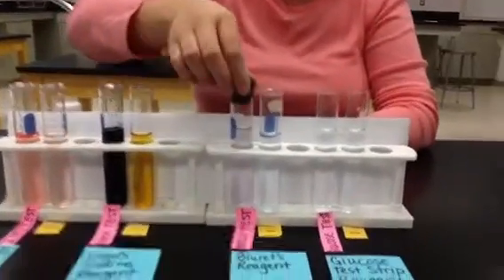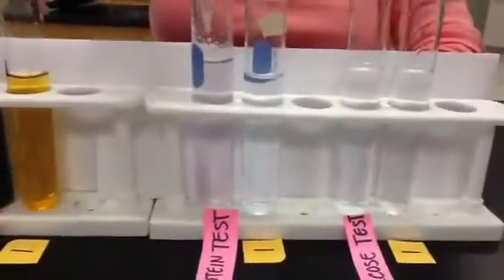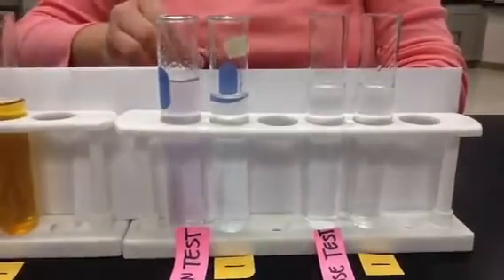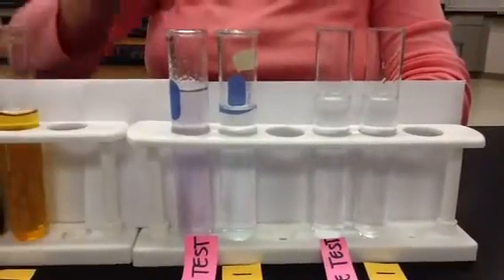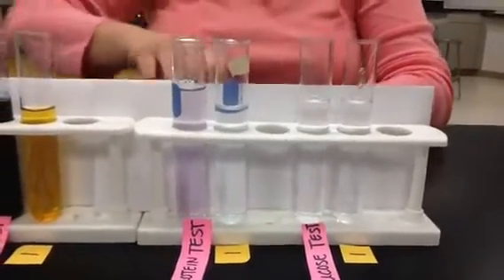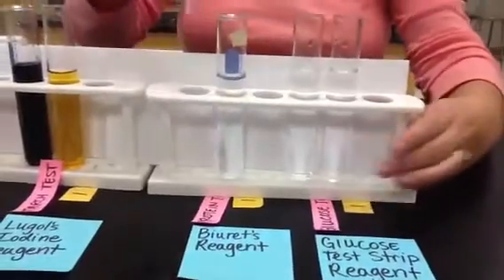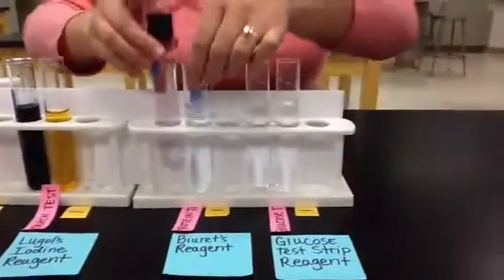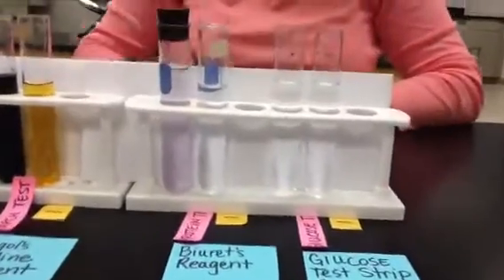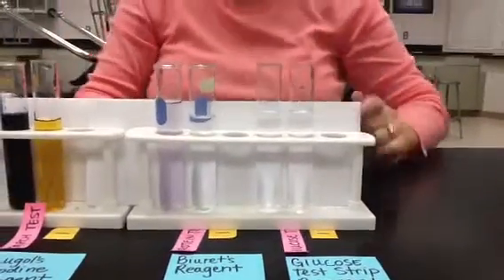Now I can see a color change. You may not, so I'm going to add a little more. And the color change here is like a pale purple. Okay, so, whoops, almost took the whole thing out. All right, so hopefully you can see the difference, maybe up against here, but you've got a pale purple color going on here. So that is a positive test for protein.